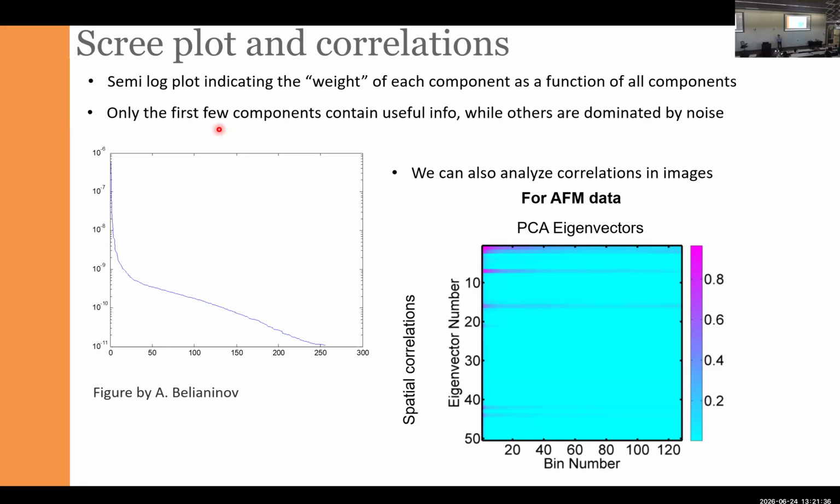In this case, however, a very important trick is that classically, if you do the PCA, the textbook will tell you that you determine which components matter and which don't based on the inflection point in the so-called scree plot, the magnitude of the eigenvalues.